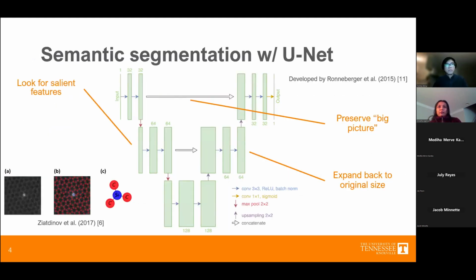Exact role. Yeah. So skip connections bypass these deeper layers directly. It actually retains more information of the original image. And therefore it gives a broader view of that image, so there are basically different levels of feature extraction in the network.